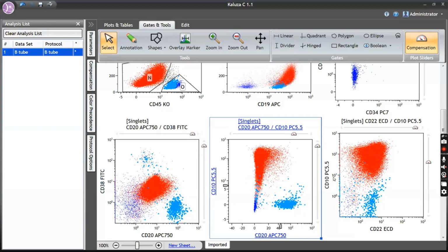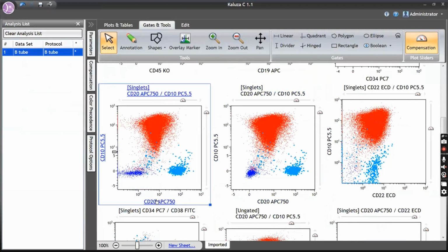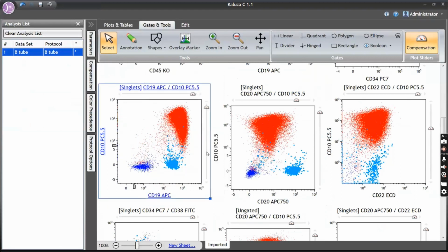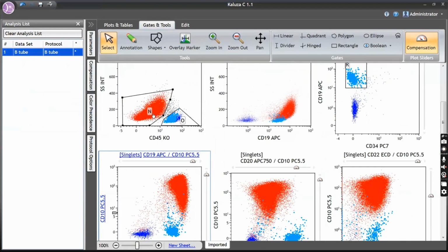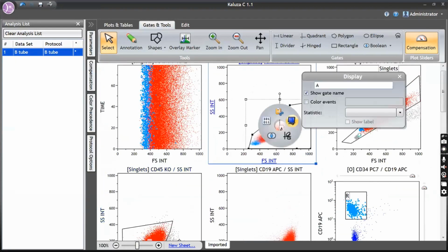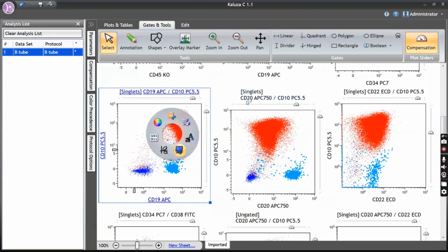Okay, let's go here. So I'll use this plot for CD19 and CD10 versus CD19. I'm not going to restrict myself only to the blast. I'm showing it completely so that you can see. So what is the expression of CD10 here? Moderate to bright. Yeah, superb. Is anyone having a difference of opinion? Please, you also give your answer. If you have a difference of opinion, you feel it is somewhat dim or something, you let me know.